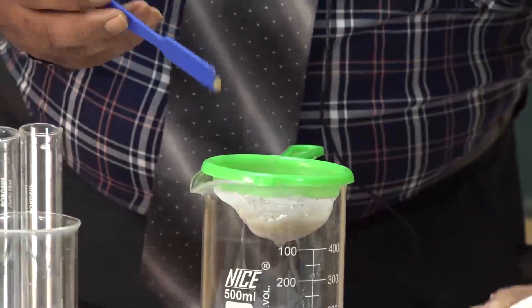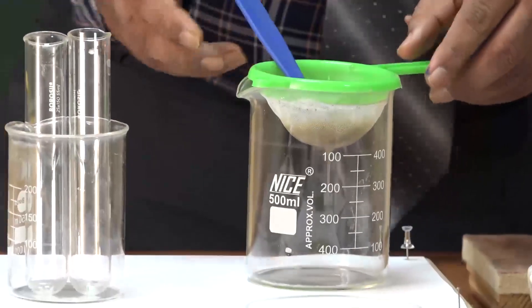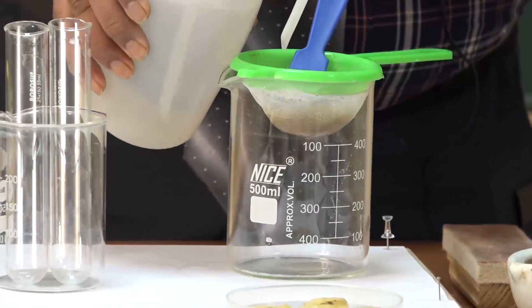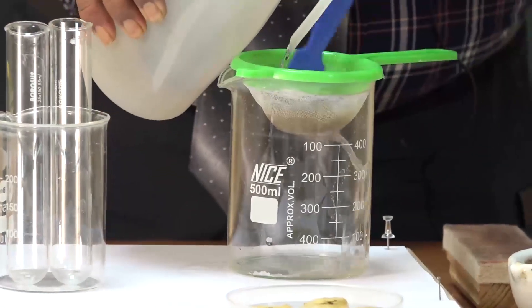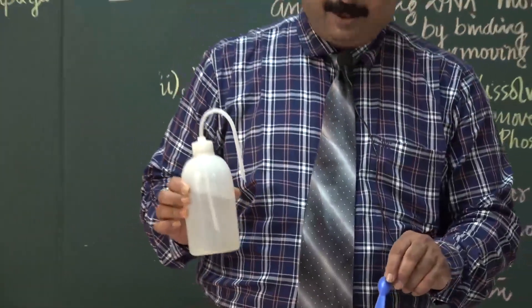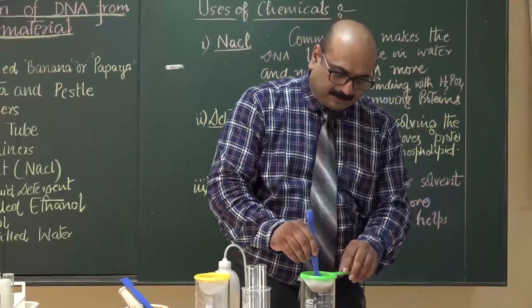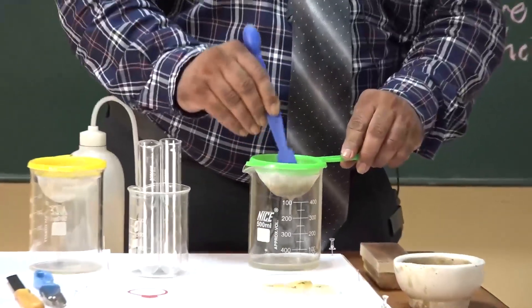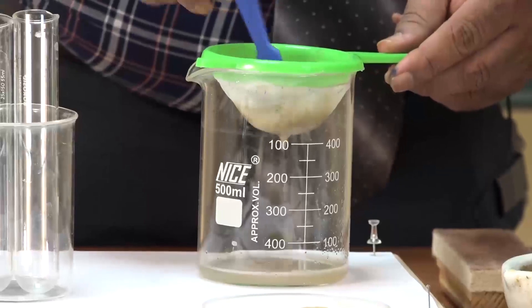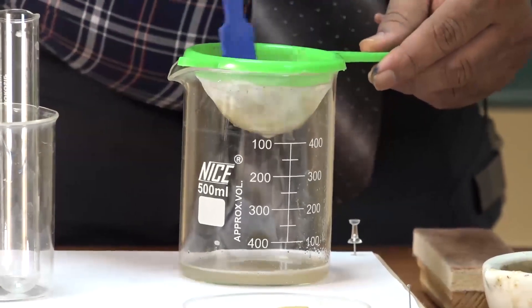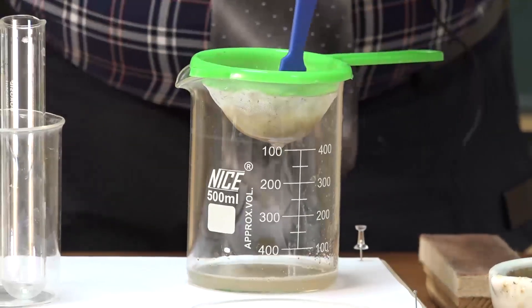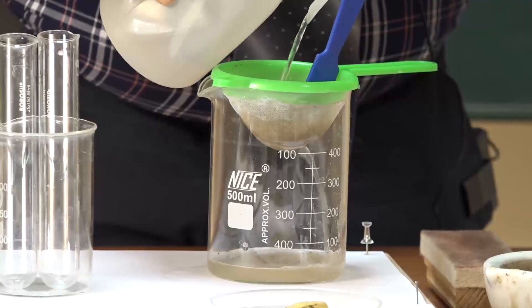Slowly, I will add water because it is thick in nature. It will not filter out easily without the help of some amount of water. Water should be distilled water. I prefer to use distilled water because I do not want to take any risk. Distilled water is pure water. Stir it gently so that enough amount of cells should be filtered and must enter into the test tube with the liquid part of this slurry.